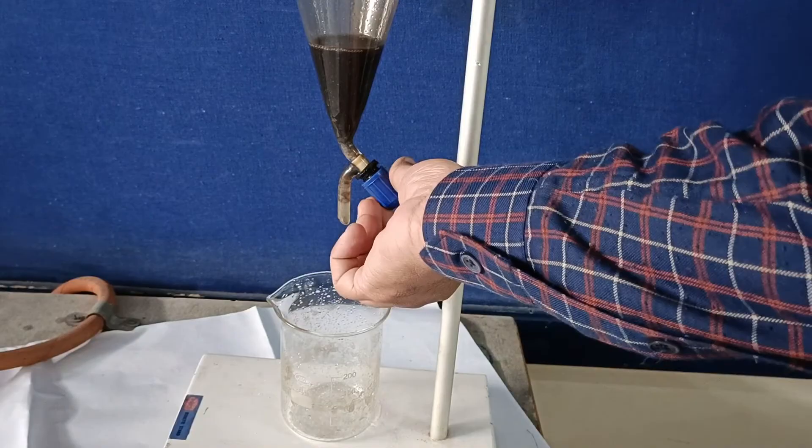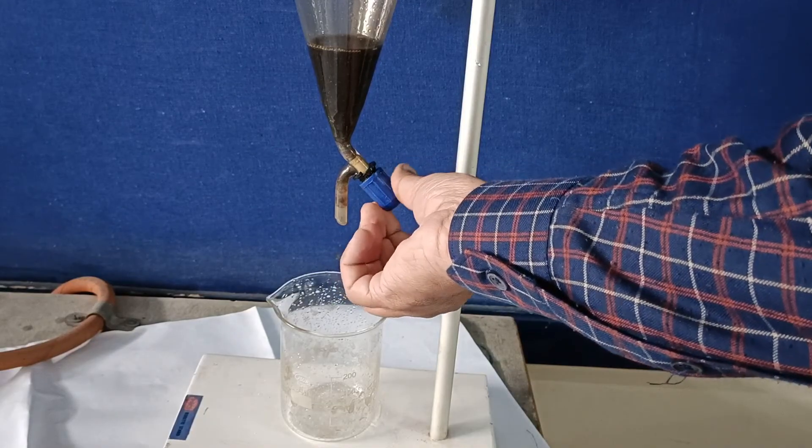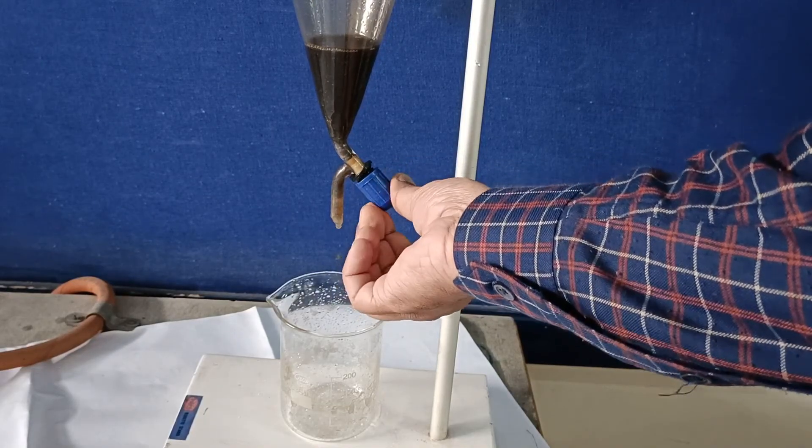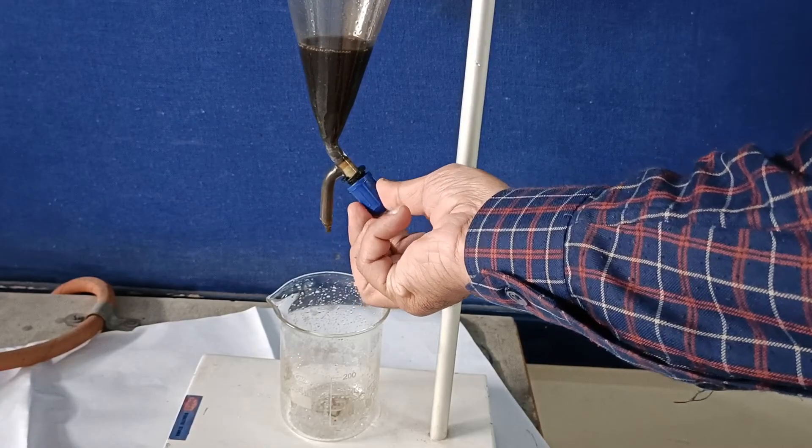Close the stopcock and place another empty beaker underneath. Open the stopcock to collect the lighter liquid.